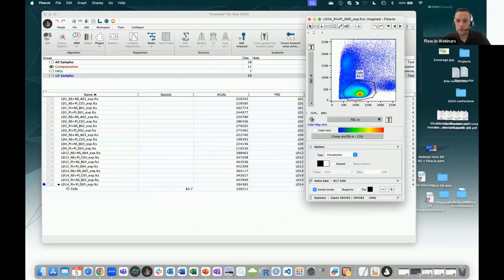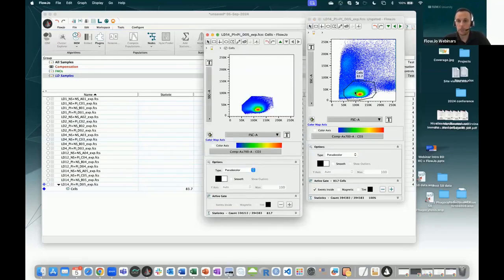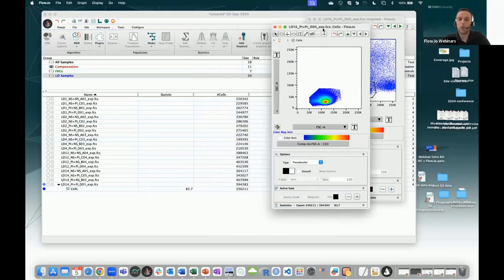All right, so now I want to select my cells and go deeper in my analysis. I'm just gonna double click on it. Now it opens another graph window that's only containing the cells from that gate. And then now I can do a doublet discrimination, which is forward scatter A versus H, and select the diagonal again. So I'm gonna select polygonal gate, double click to close it, make sure I select the diagonal. Okay, so 99.5% on singlet, double click on it to only select those cells.